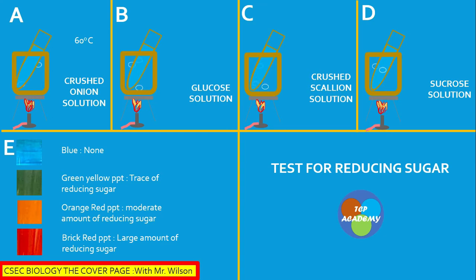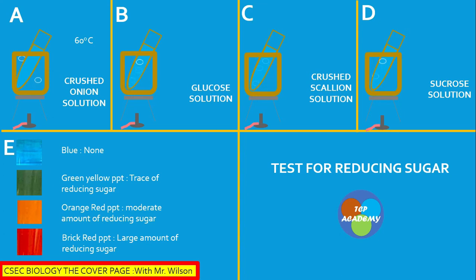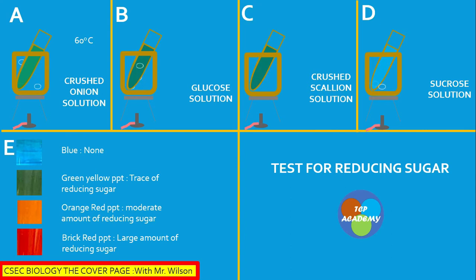If reducing sugar is present, we expect to see an orange color, and if the test continues, it will show a red precipitate. It's very important to time this experiment and maintain the temperature above 60 degrees Celsius. Pay attention to the screen as color changes occur, and record all color changes in your table as you document your observations.